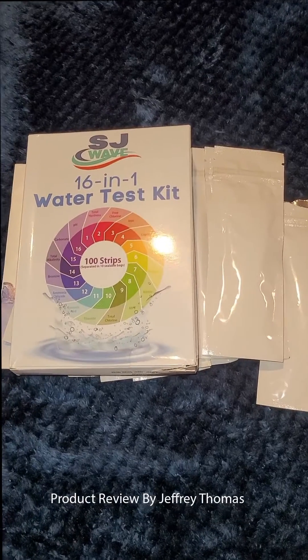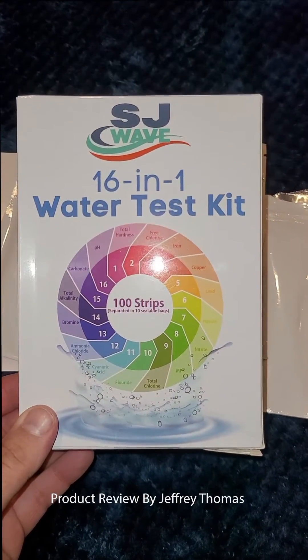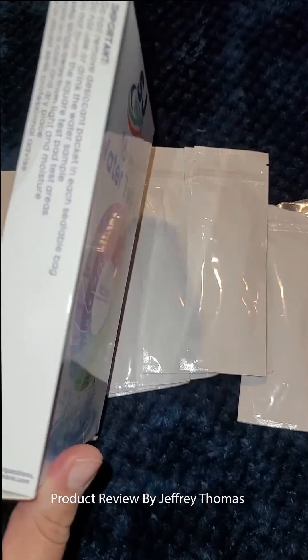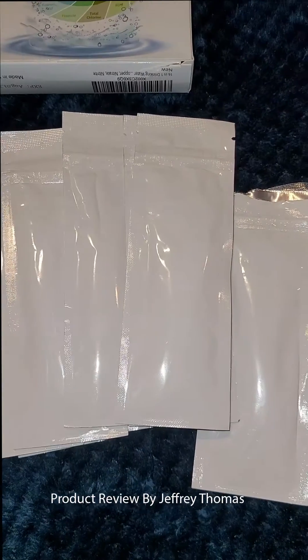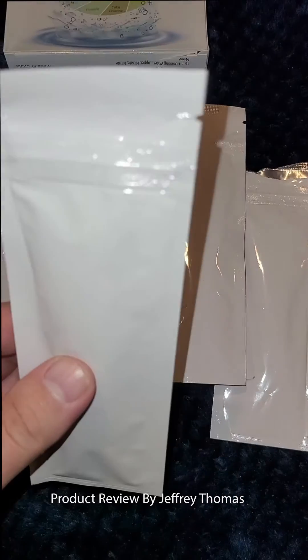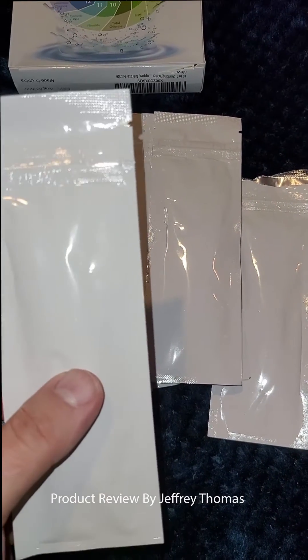Today I have for you a 16-in-1 water test kit. You get a hundred strips and these are very easy to use. One of the things I like about this is that they only put so many into each packet, and that packet stays watertight — you don't have to worry about test strips sitting around getting moisture from the air.